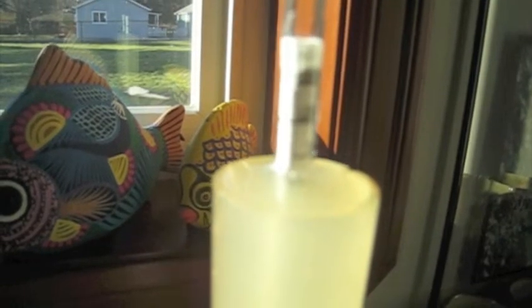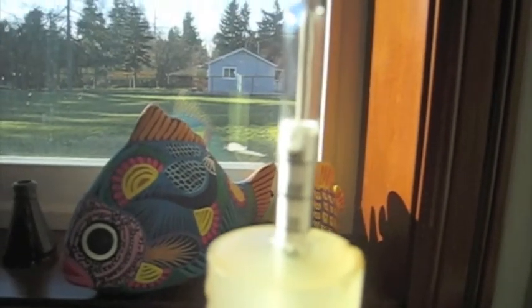Here's the first one. This is the mini mash output. Let's see if we can take a good look at that. I'm going to call that 1014, 1015. Somewhere in there. Let me go ahead and write that down.